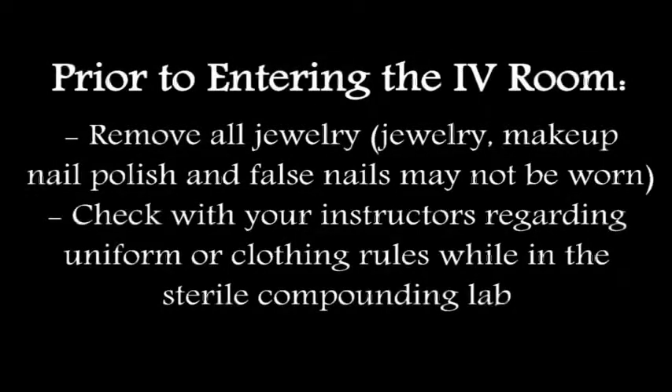Prior to entering the IV room, remove all jewelry. Jewelry, makeup, nail polish, and false nails may not be worn. Check with your instructors regarding uniform or clothing rules while in the sterile compounding lab.